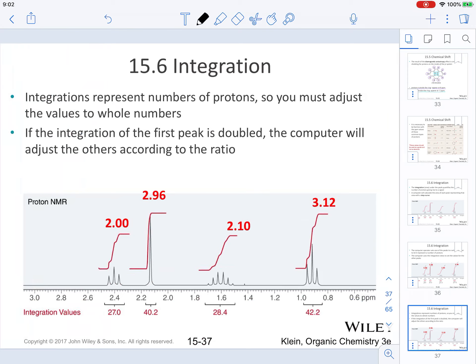Remember, integrations represent number of protons, so at times you must adjust the values to whole numbers. If the integration of the first peak is doubled, the computer will adjust the others accordingly. In this case, the first integration was set to 2, so all the others are doubled. Looking at the ratio of protons across these signals, this represents a ratio of 2 to 3 to 2 to 3, representing the relative number of protons on each signal.